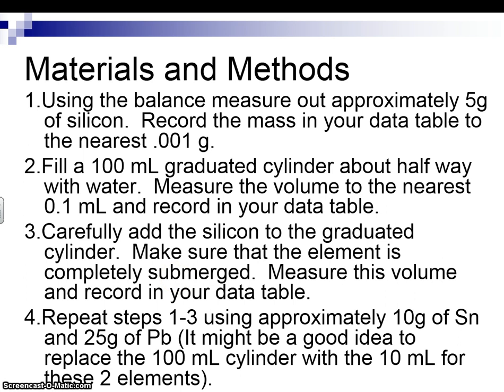So please be very careful to block it with your finger or catch it in your hand as you empty the water out. When you're done with that sample, you're going to need to return it without using your weigh boat to a collection area that your teacher will provide for the wet sample. Do not get your weigh boat wet, and do not put it back in the original container you got it from, because with wet sample in there, it'll throw off everyone's mass measurements for the whole rest of the day. Make sure it goes back only in the wet sample container that your teacher has provided for that type of metal. Do not mix the types of metal ever.